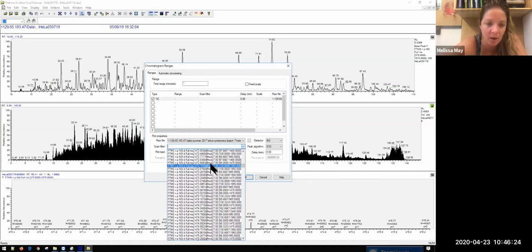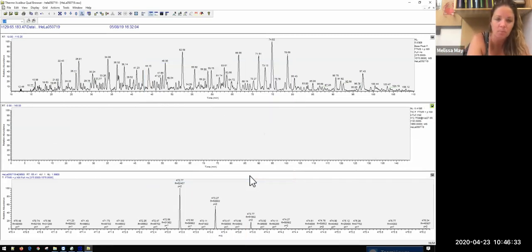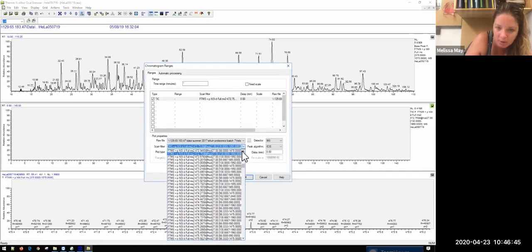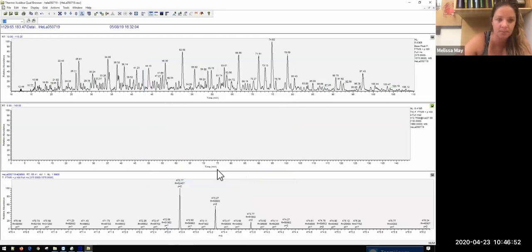And you can see that there are quite a bit that are in this range because these are complex samples, right? This is a HeLa digest, so it's a whole cell. So if I were to click on this, I picked the wrong peak, which is fine. Oh, so it was 0.77. Let's wait for it to come back, which I saw just a couple up. Here we go. So if I click on this, also not showing me anything. Great. Let's try a different peak.